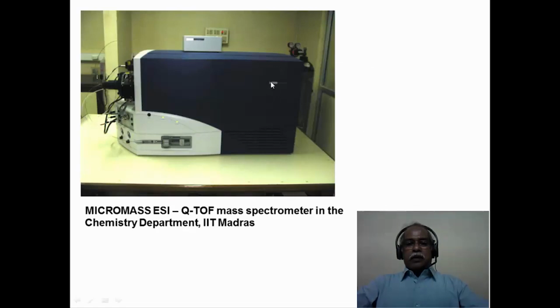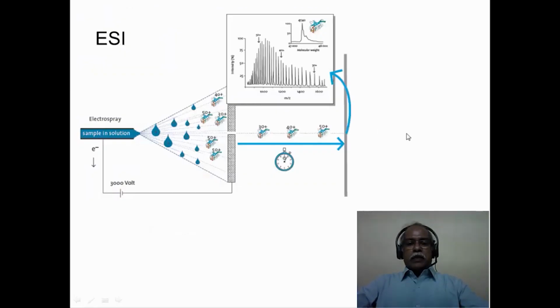You can see here this is just a box that can fit on a tabletop, but it can do wonders in terms of the mass analysis that it can do in terms of the molecular weight and the sensitivity and so on. Now in the electrospray ionization mass spectrometer, there is an injector which sprays the solution or the analyte to be analyzed in the form of very fine droplets, and it does so in a voltage region where the sprayer itself is one electrode and there is a counter electrode kept here.